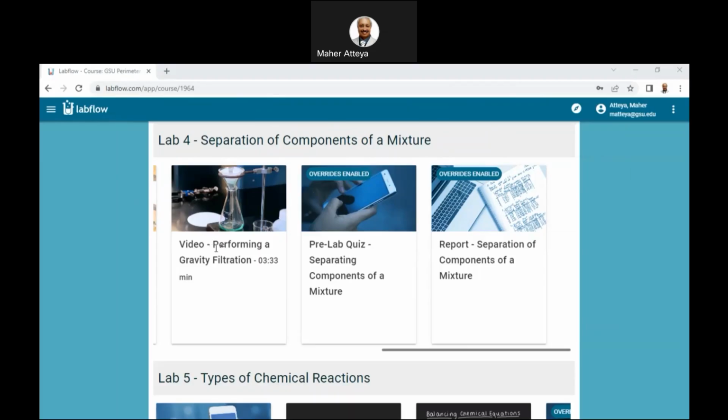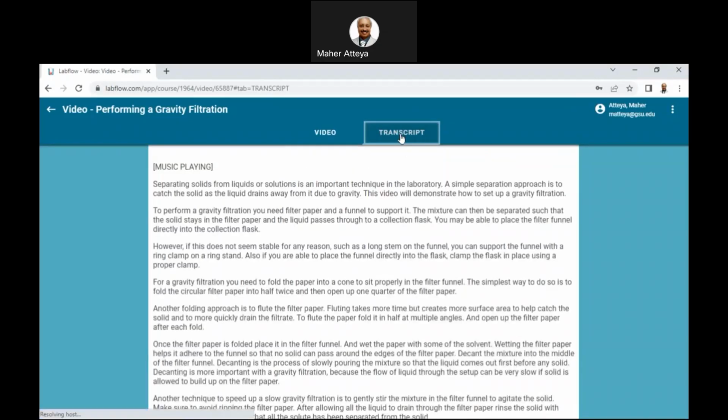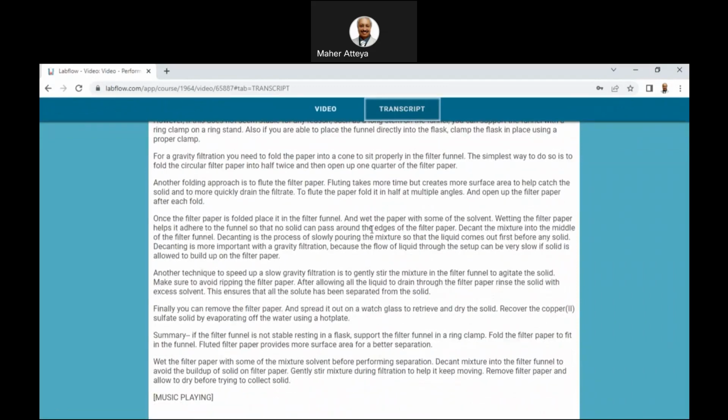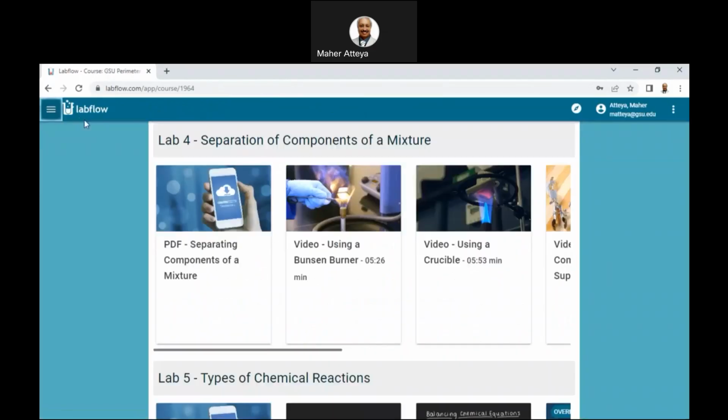So now let's go and look at the theoretical background file. I'm not putting all the stuff here. Let me go back.